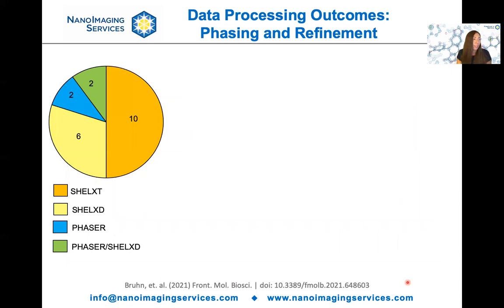All right, so here's a look at how we are phasing these. For the ones that we phased internally, about half the samples could be phased with SHELXT, which was exciting because that's the method of choice.